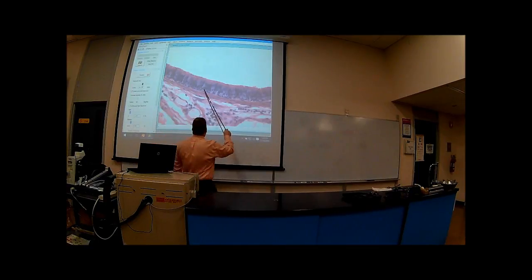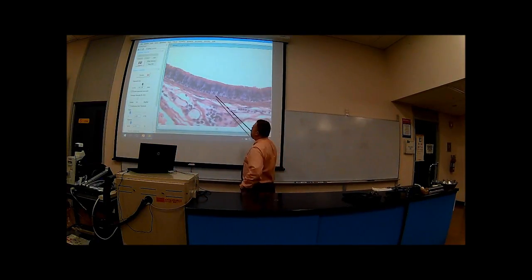And what you're looking at over here, this is the epithelium. And it looks like there's a nucleus here, nucleus here, nucleus here, nucleus here, nucleus here. So it looks like there's a lot of layers in this epithelium. However, if you follow each one of these to the basal membrane, each one of these cells is attached to the basal membrane, making this not a stratified epithelium. Looks stratified, but it's not. This is actually simple, so it's more of one layer. The thing is, it looks stratified, so we say it's pseudo-stratified. Okay? This is pseudo-stratified epithelium.